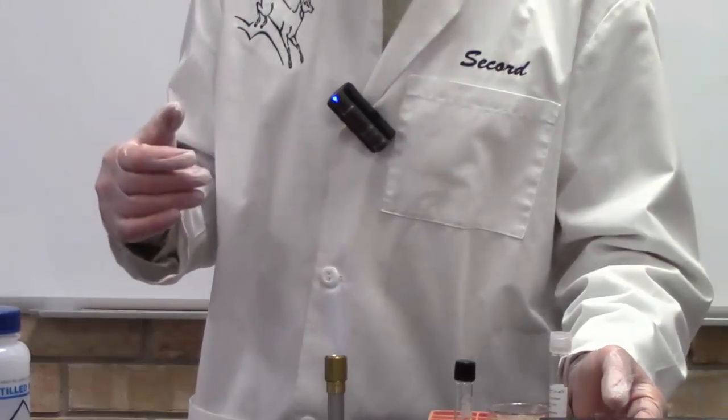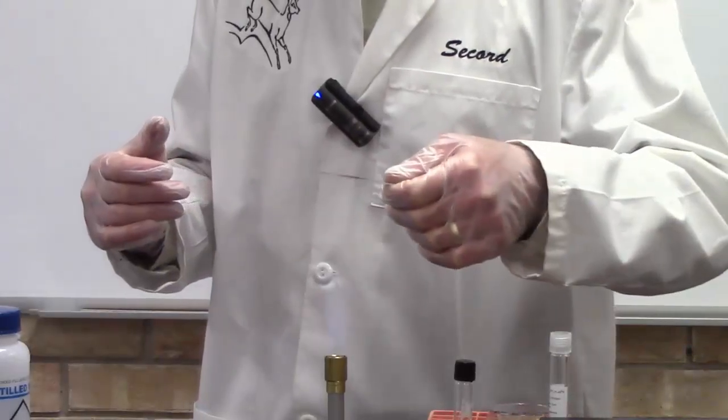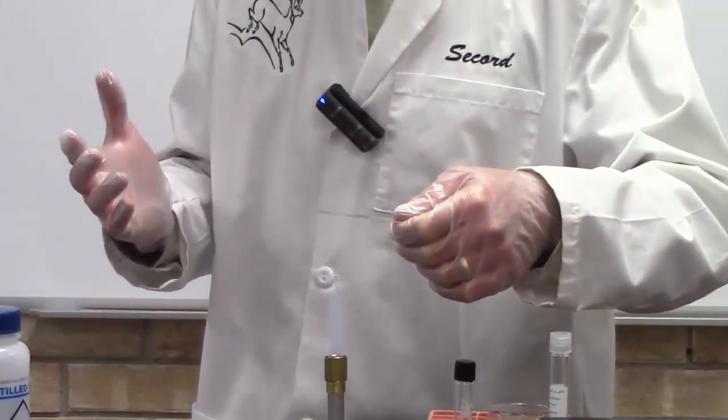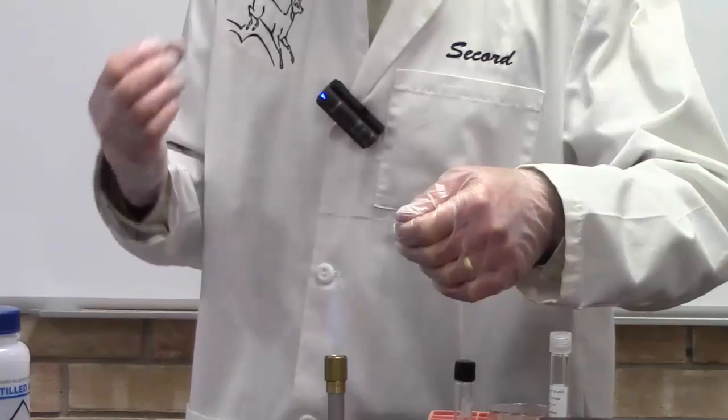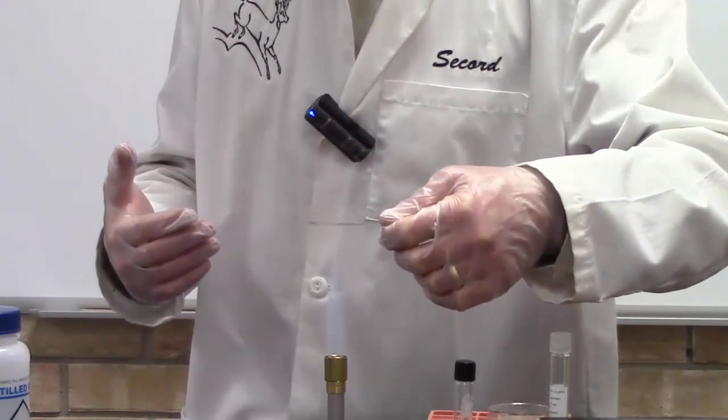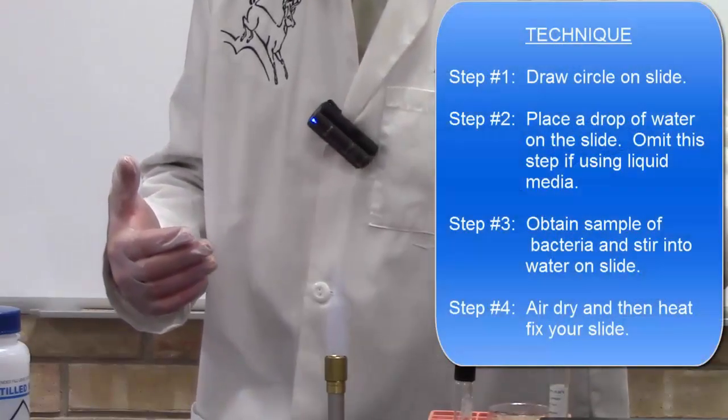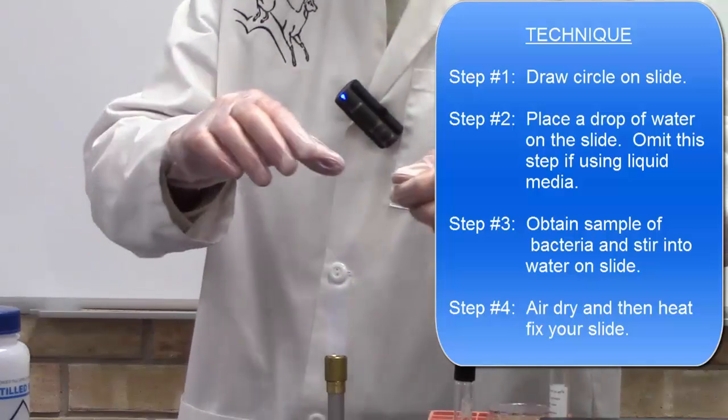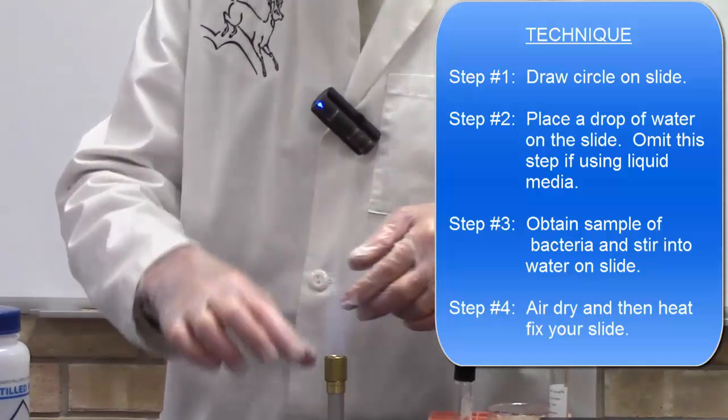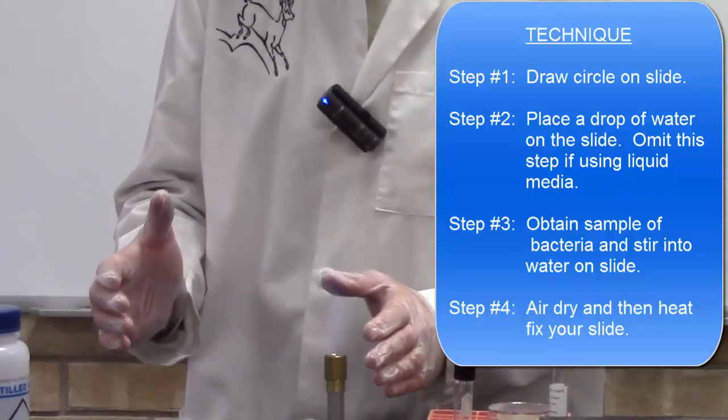After the water has evaporated, next we'll need to heat fix it. To heat fix your slide, you just run it through the flame three times. Don't hold it in the flame because the heat will distort the bacteria. You just pass it through. So something like this: one, two, three. And there you go, it has been heat fixed. So that is the proper way to do a bacterial smear.